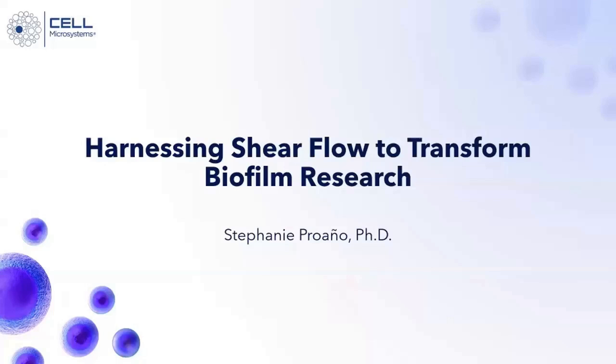Hello, everyone, and welcome. We're excited to have you here for today's fast 30-minute webinar on using shear flow to study biofilms in realistic environments. Let's be honest, biofilms don't grow in still plates. They grow under flow, under stress, and under conditions that are, let's just say, a little dramatic. And that's exactly what today's session is about. Real-world biofilm behavior powered by flow and real case studies.